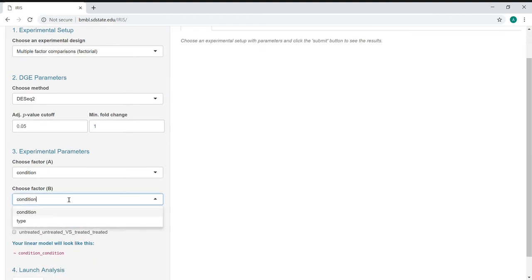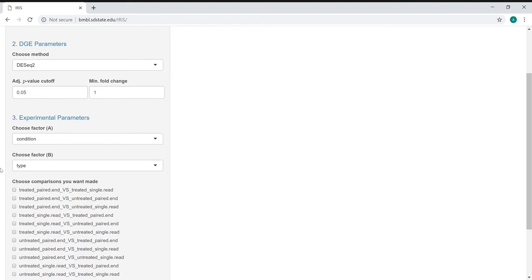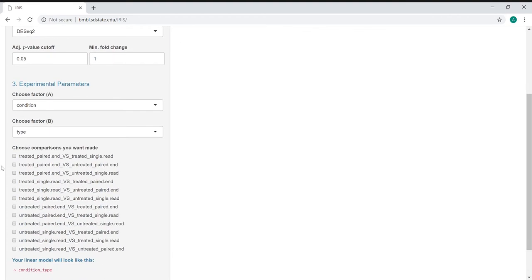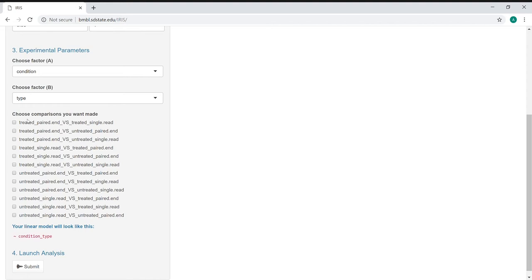This allows you to separate the information a little bit more. If we wanted to do the treated paired end versus the untreated single end, we could actually do that comparison specifically here. If you have time point data, that might be particularly of interest.